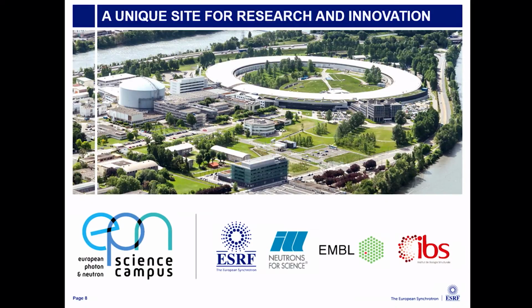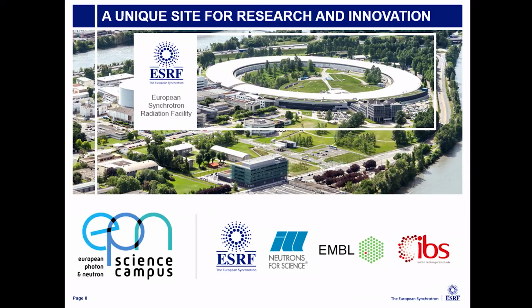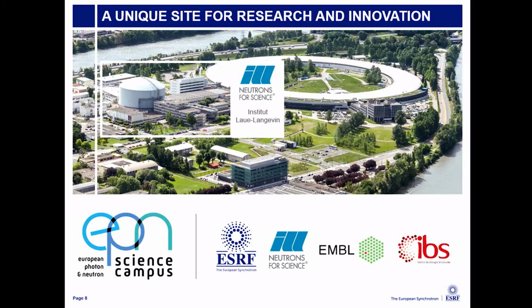On our site, this is our site, the European Photons and Neutrons campus, right at the end of the synchrotron, big round thing, you can't miss it. This is the Institut Laue-Langevin, and Trevor, who's at the back over there, is going to say something about neutrons a little bit later on, I think this afternoon. This is our sister institute where they generate neutron beams instead of synchrotron X-ray beams.